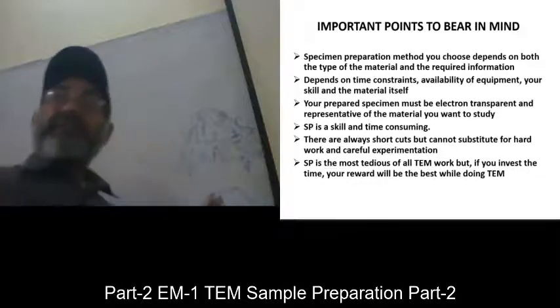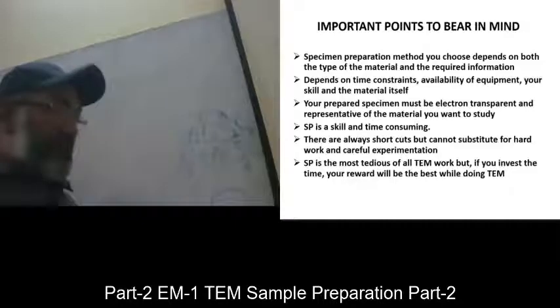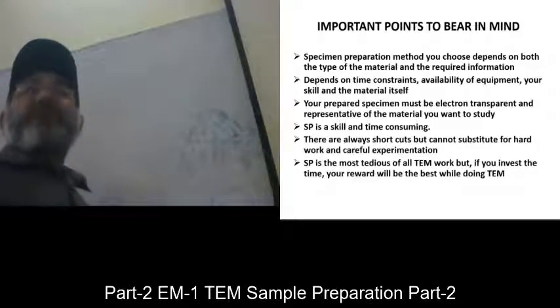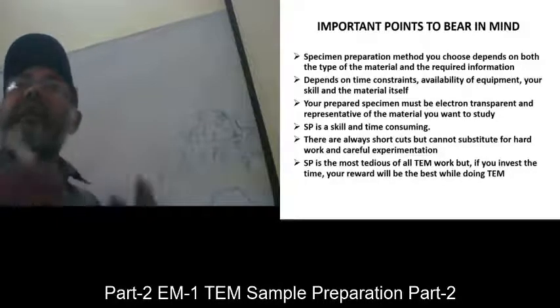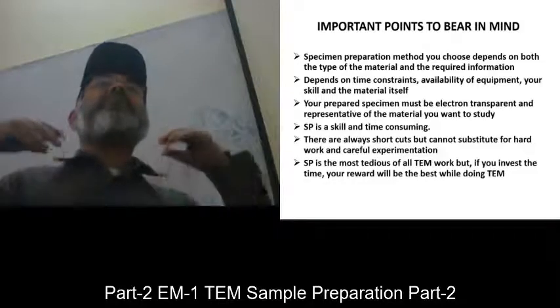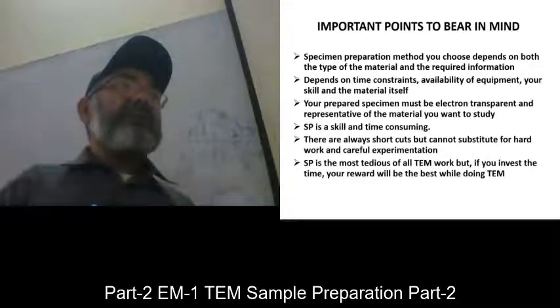So for a fully crystalline material, if you are doing microscopy, I will advise you to look into this grain composition, this grain composition, this grain, if you are using a scanning electron microscope, or if you are using TEM, then you are talking of crystals. So don't rely on a single crystal. Take spectra from as many crystals as you can. That will give you better statistics.